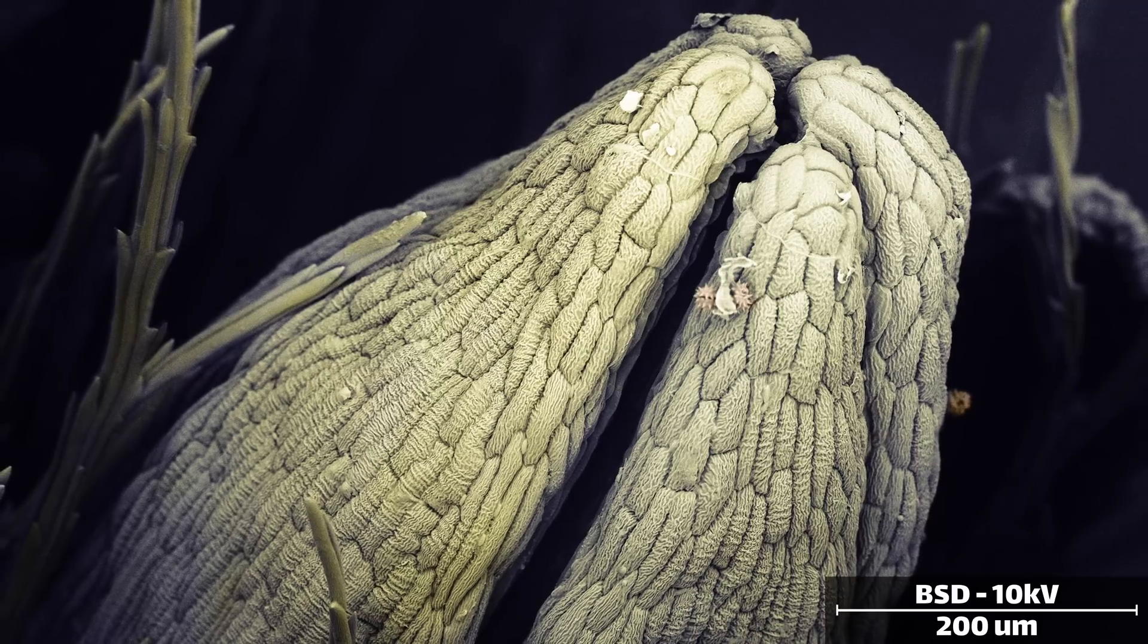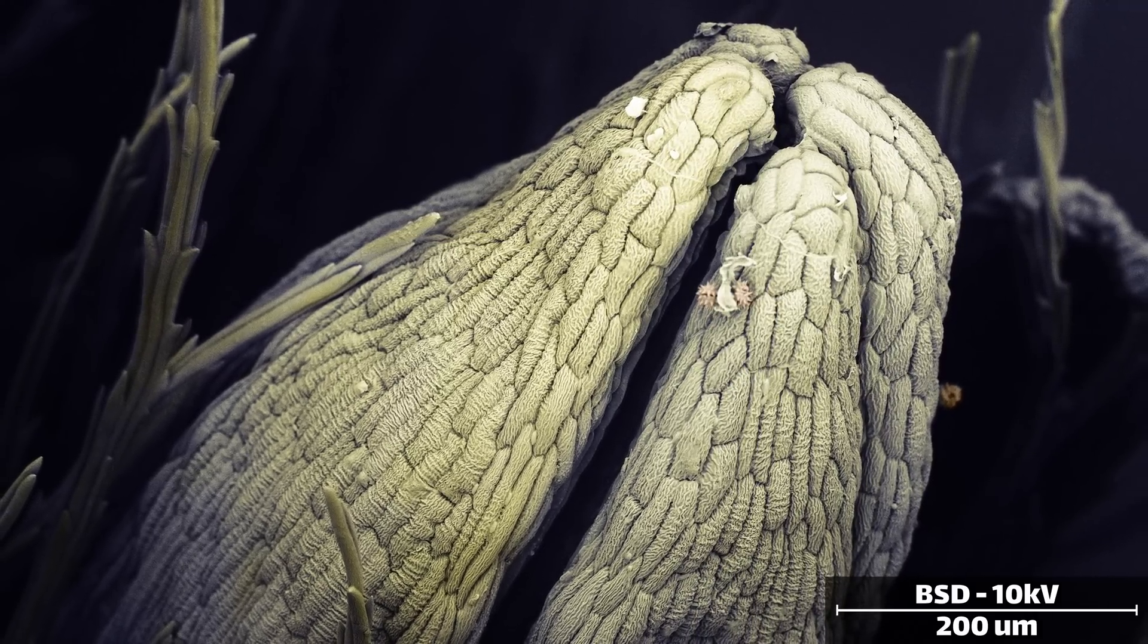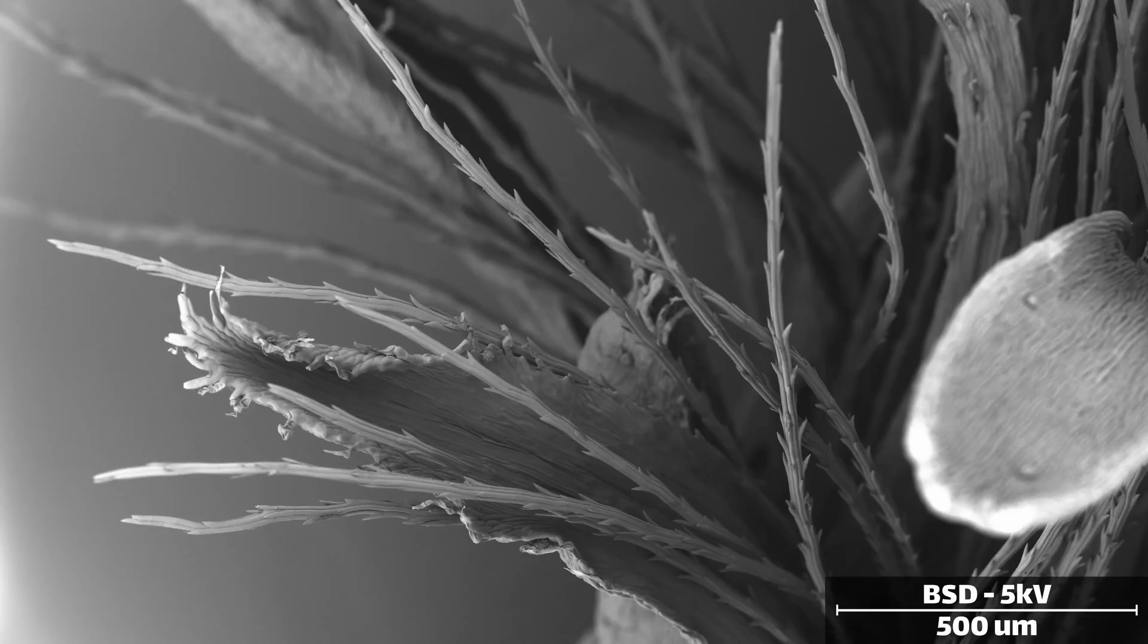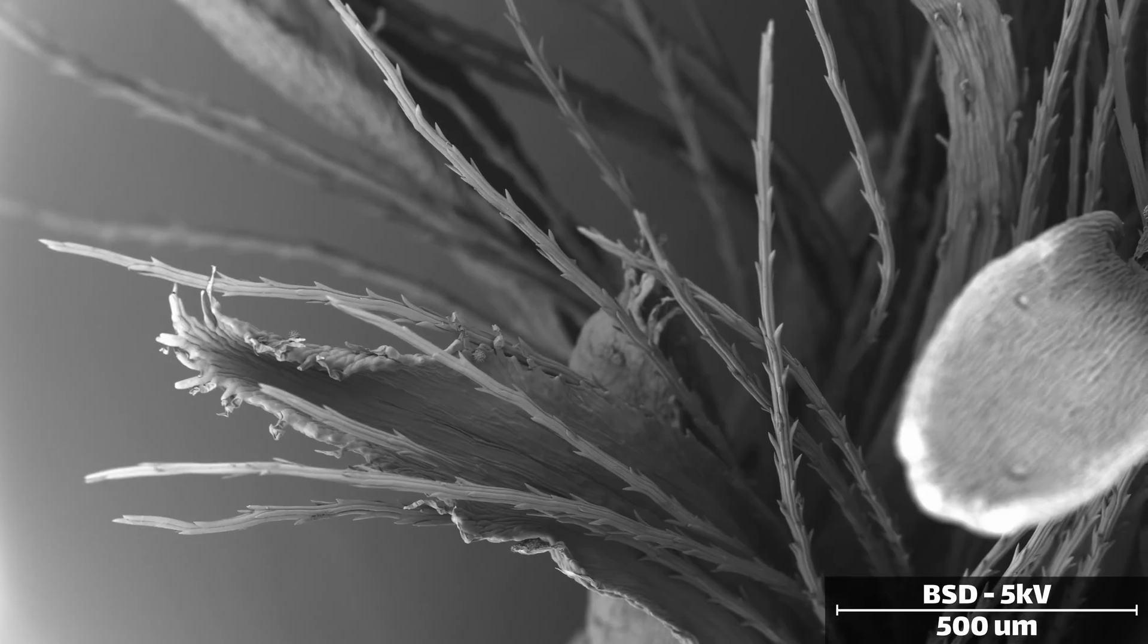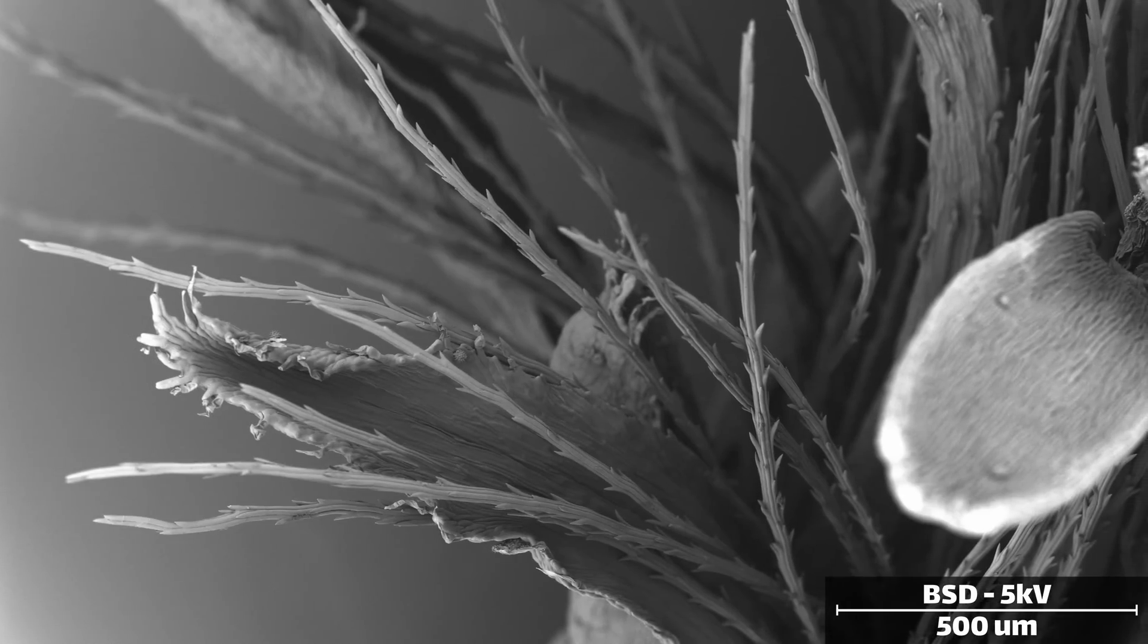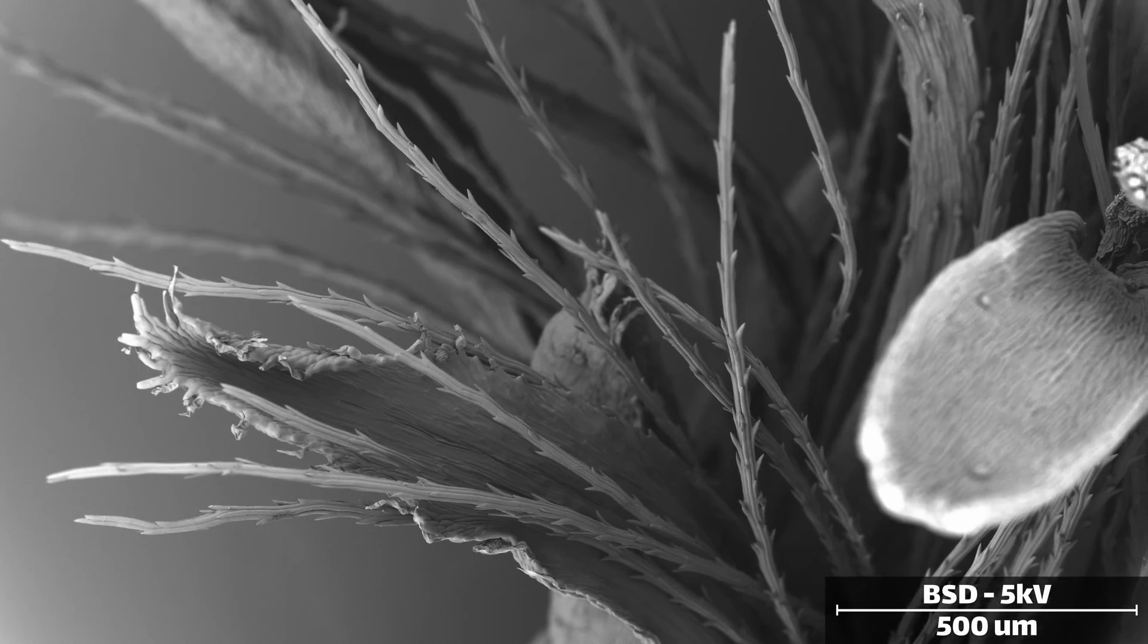Other structures that we see include flower petals, which remind me of an eel emerging from the depths of an ocean. These fine filamenty structures scattered around are called pappus. These structures give rise to the white fluff on dandelions, but on goldenrods, they're just fine hair-like structures around the base of the flower.